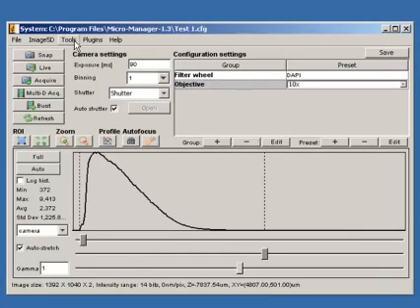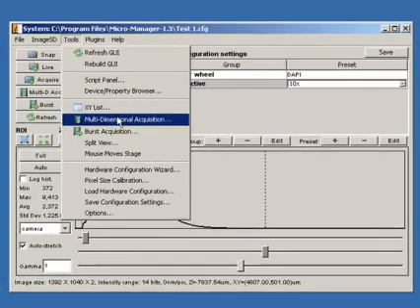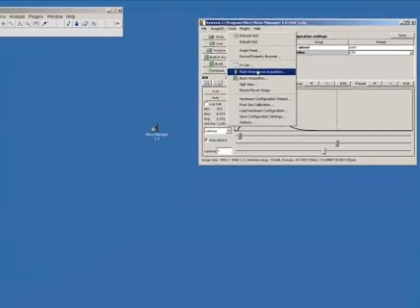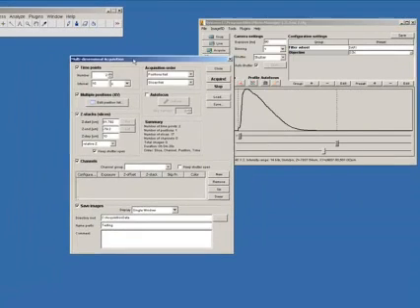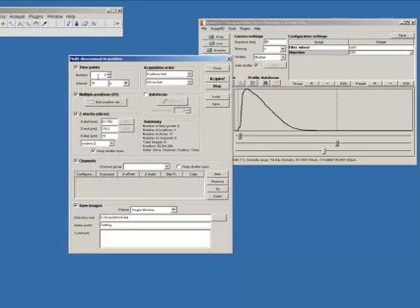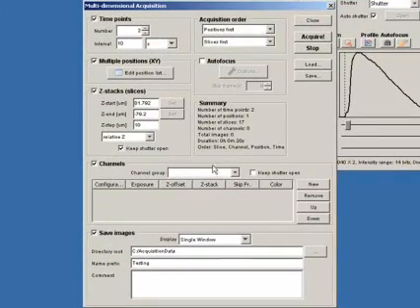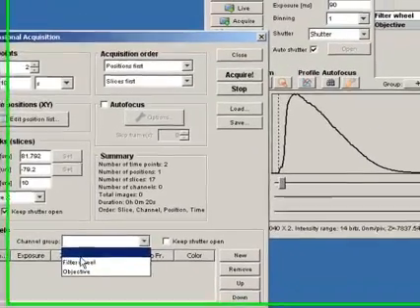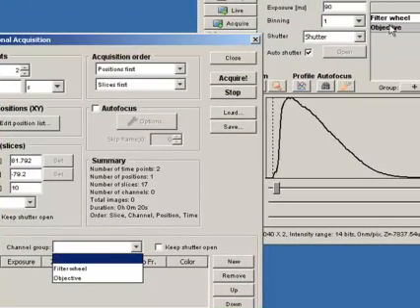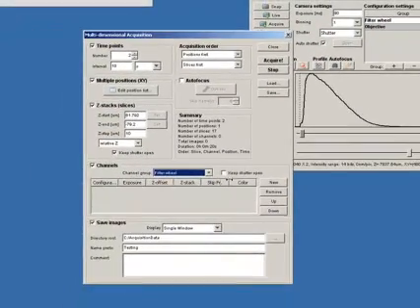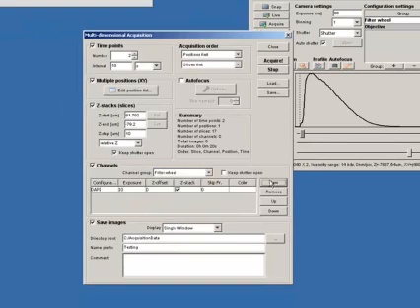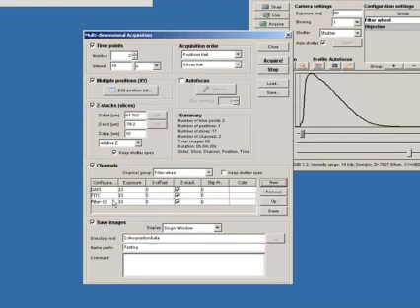Now let's look at setting up a multi-dimensional experiment. So, if I come to my tools here and go to the multi-dimensional acquisition. You can see this is where I've got my various options for controlling time points, multiple positions, slices, channels and so on. So, first of all let's set up the channels. And we're going to use, the channel group is going to be our filter wheel which is what we defined up over here. And let's add a new one. And that's going to be my Dappy. And another one that will be my Fitzy. And a final one. And this is going to be the Texas Red channel.